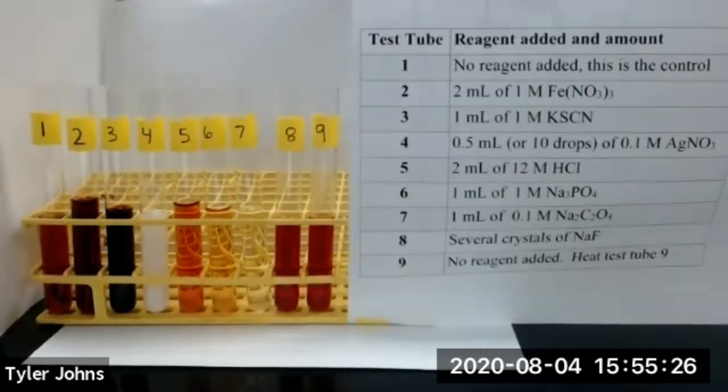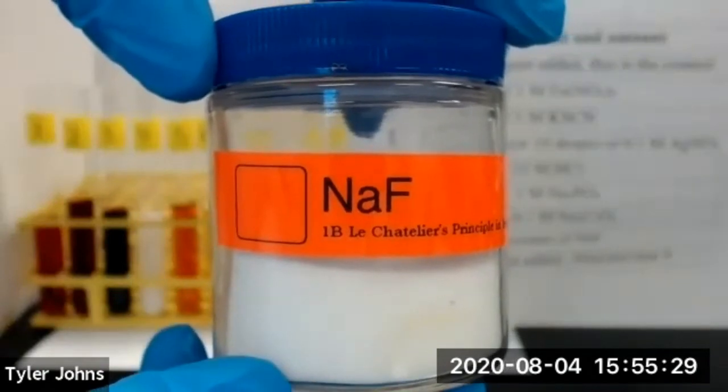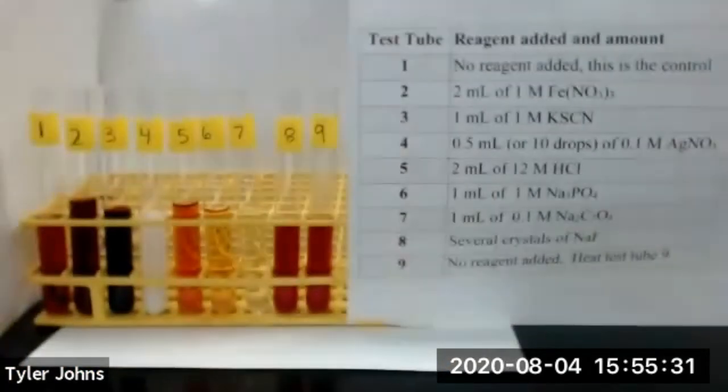We'll now add a few crystals of solid sodium fluoride to test tube number eight.